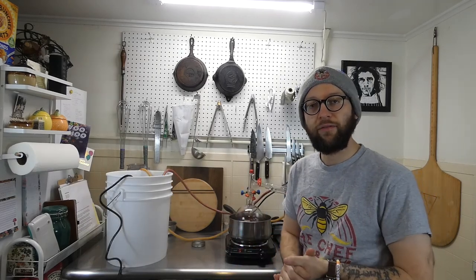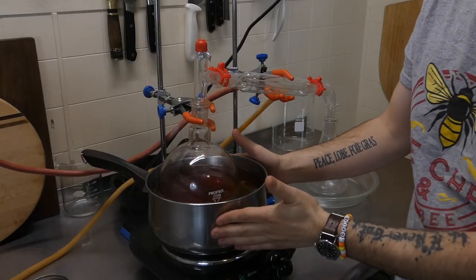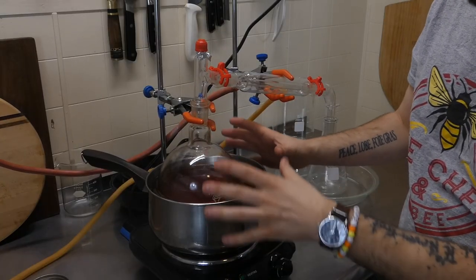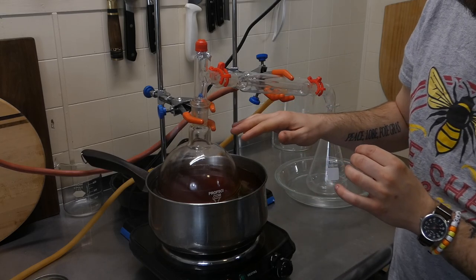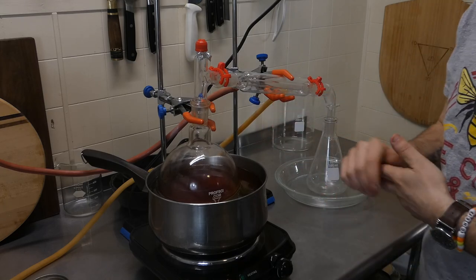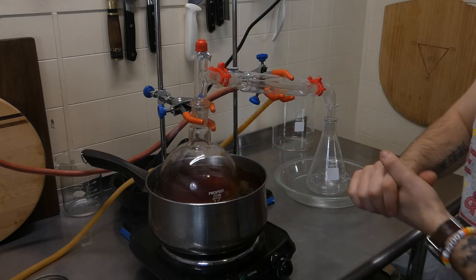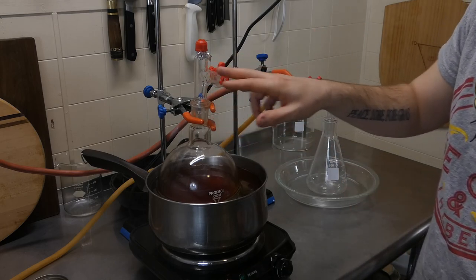All right, so this setup is a little different than the Soxhlet extraction. As you can see, we are still using oil as the heat conductor. On the hot plate, we have the capsaicin extraction in the original flask with boiling chips in it to try to prevent all of it ending up in there all at once from boil over. We have a little distillation arm here. It comes up and over.